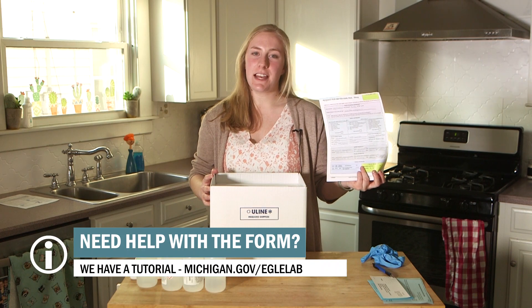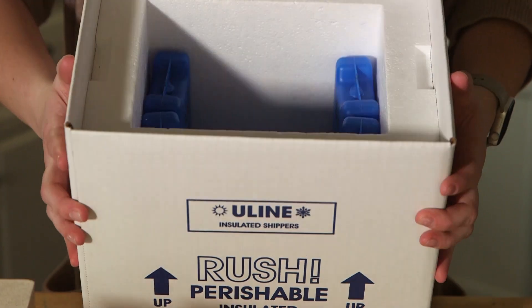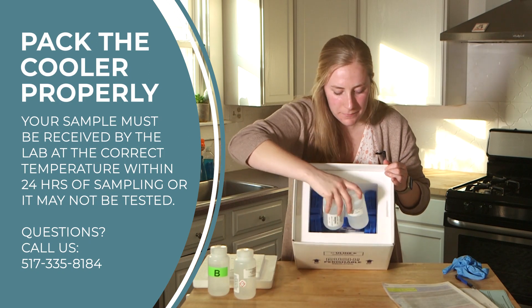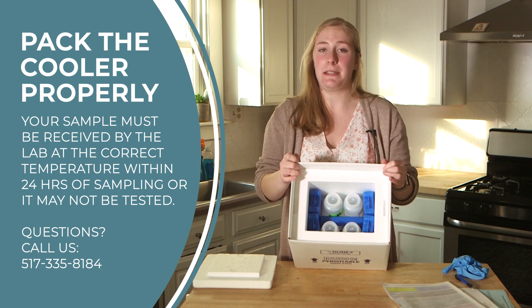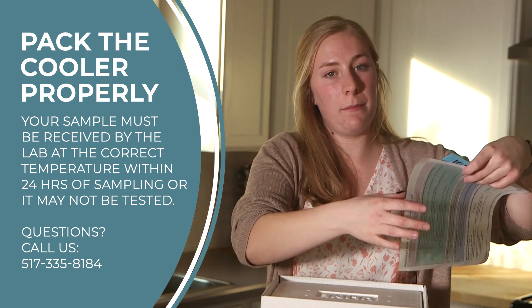Once your form is complete, it's time to pack up your samples for shipping. Let's start with your ice packs — you want to place them like this. Notice how they make the letter I, like for ice pack. Now fill in the gaps with the sample bottles. It's important to pack this way because your sample must be received by the lab at the right temperature or it can't be tested. Now it's time to put the cooler lid on — make sure you put it on tightly. Then place your form and payment on top.